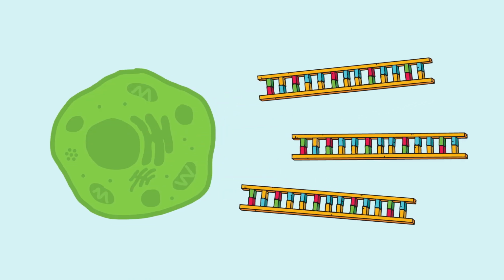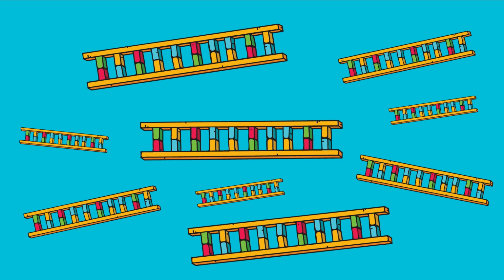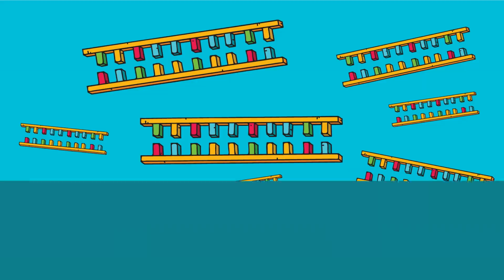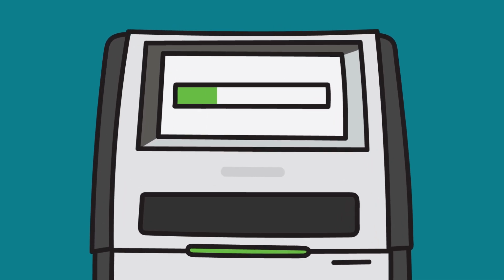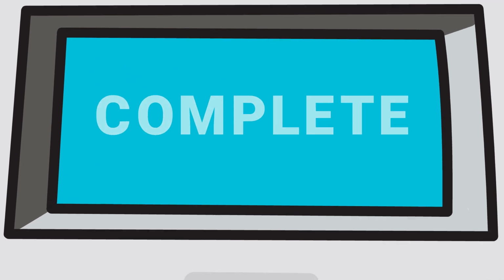First, extract DNA from your cells. Next, PCR amplify a set of standard STRs using a commercially available kit for cell line authentication. After that, separate the fragments using capillary electrophoresis. The size of each fragment will be recorded.